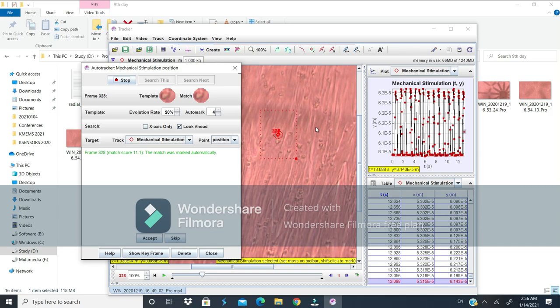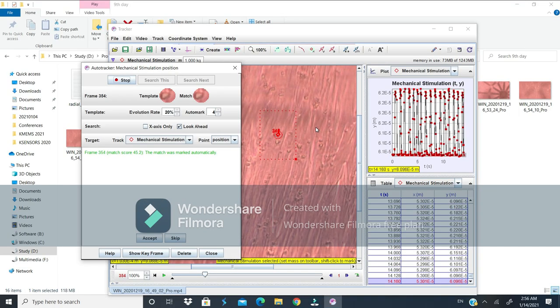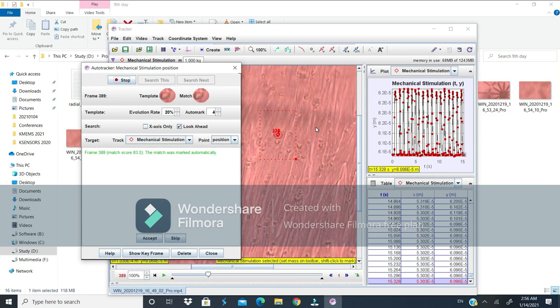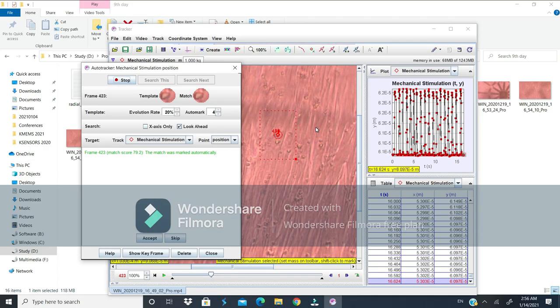In the case of ImageJ, there are a lot of lapses, and the acquisition of data is not quite accurate. Another problem I found while using that program is that it's difficult to track very small cell beating.